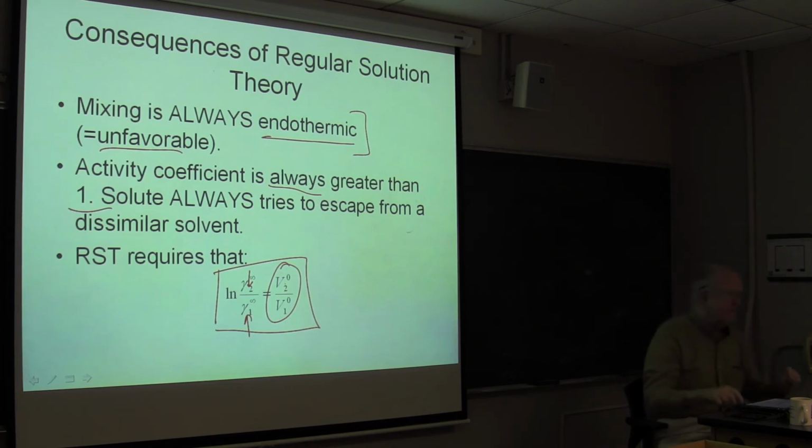It applies to enough things that there are 2 papers that I want you to read. It's the papers by Snyder, S-N-Y-D-E-R, Karger, K-A-R-G-E-R, and Eon, E-O-N. If anybody speaks French, you will forgive me. I don't do French very well. It's two papers where they take the basic equations of solubility parameter theories and derive the retention factor in gas-liquid chromatography, gas-solid chromatography, liquid-liquid chromatography, and liquid-solid chromatography. They have pulled all of chromatography together and predict retention.